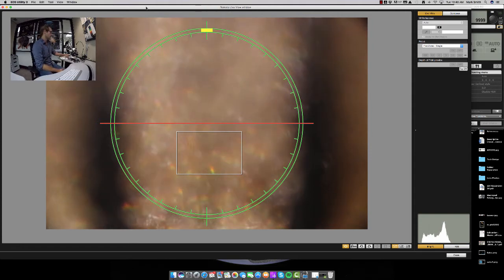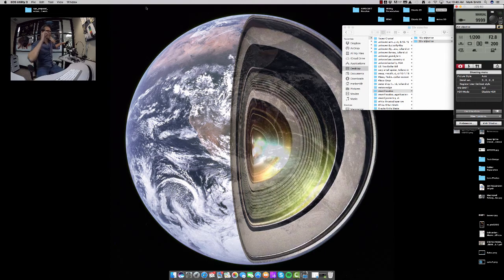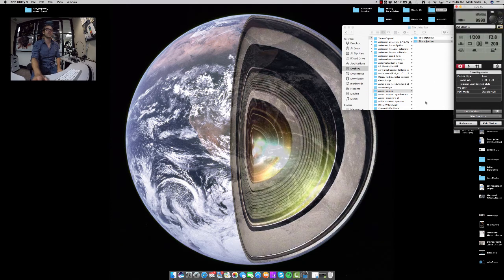So I'm going to go ahead and hit set for end, and then I'm going to turn out my direct light source. We want to capture a sample photograph just to see what our lighting is going to be like. Now for the 20x objective, the types of settings you'll be using are pretty consistent with the 10x objective, but some things will change. On this lens, nothing changes — it's still set to 200 millimeters, still set to infinity, still set to manual focus. Always when you're focus stacking, all the ultrasonic motors are turned off and you're using that distance of 1.2 meters on the side — switched to 1.2 rather than 2.4.